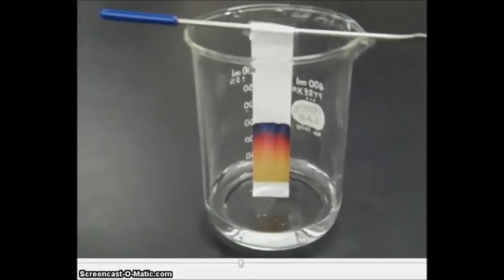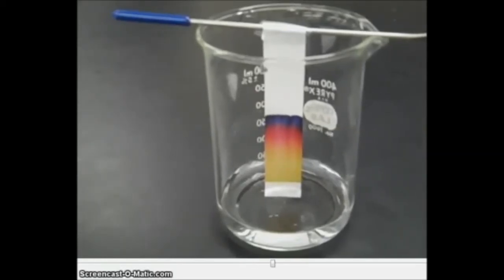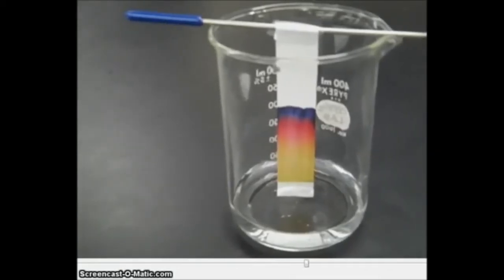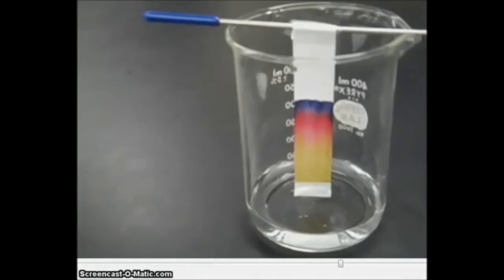This is because the different pigments have different properties. Some of them are heavier, some are lighter, some are more soluble in water, some are less. Because of these differing properties, all of the different colors are going to travel at different speeds. And by the completion of our experiment, we should see some very nice separation of the different pigment colors.